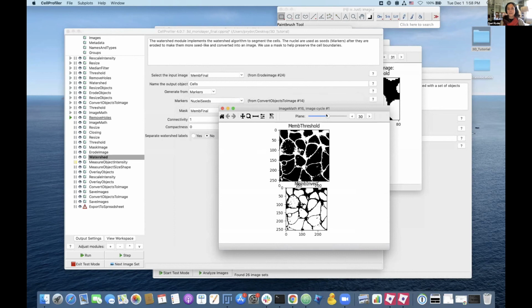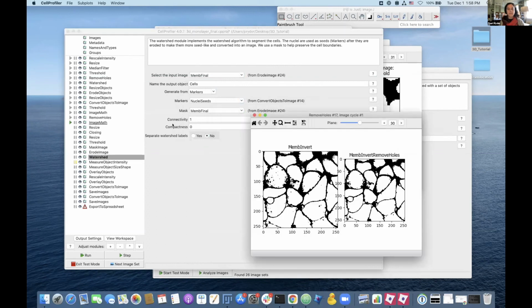But if we scroll down to the bottom, what was background in the original image is now very bright in our thresholded image. And that's not what we want. We want the background to still be black. So how can we do that? One thing we're going to do here is first fill the holes in this image. That's unrelated to the background problem. That's just getting this image closer to what we want for having bright centers.